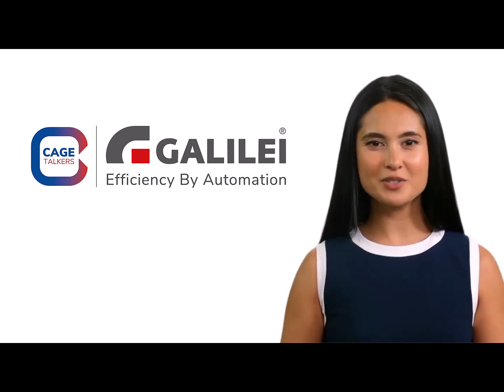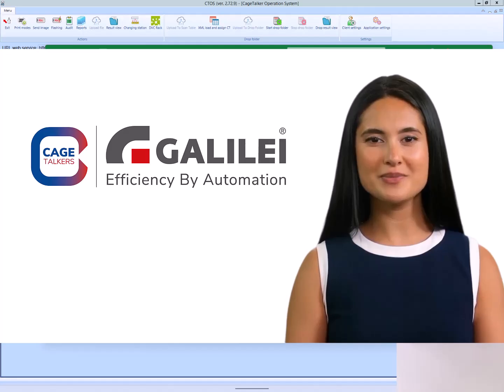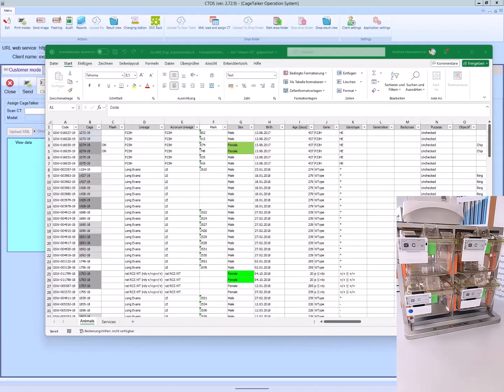Let me show how the DVC rack works together with cage talkers and how they form a closed cycle. What we see here is a DVC rack with pre-registered cage talkers. You can see that the cage talkers show the positions, the slot number they are in.